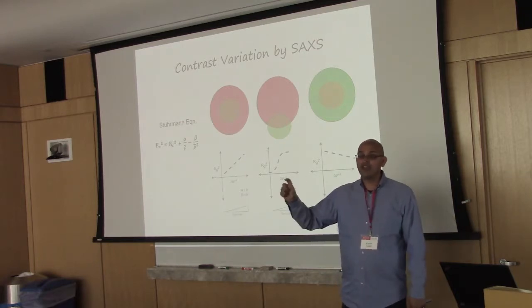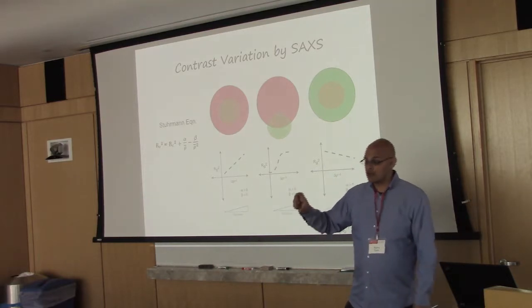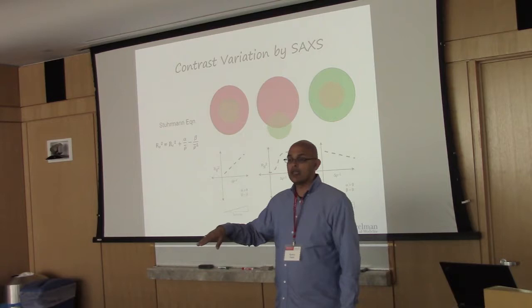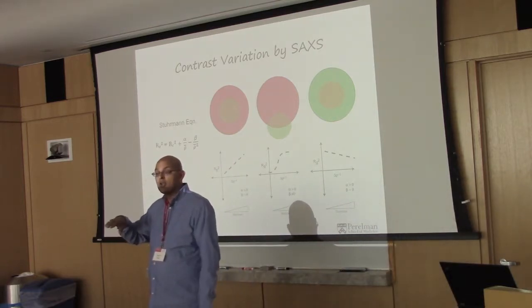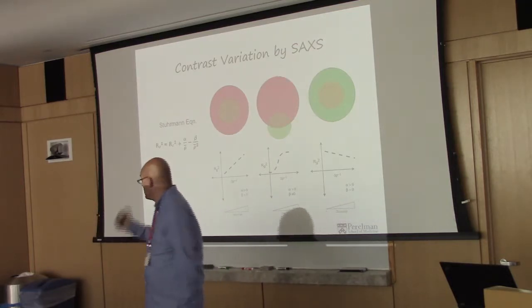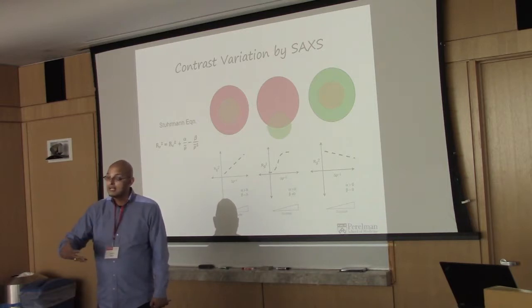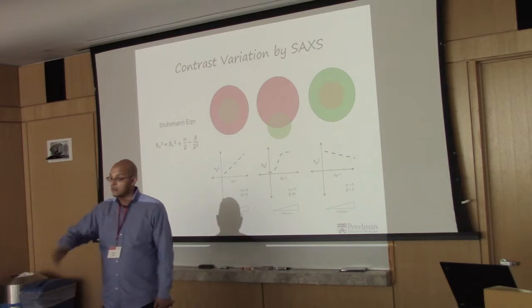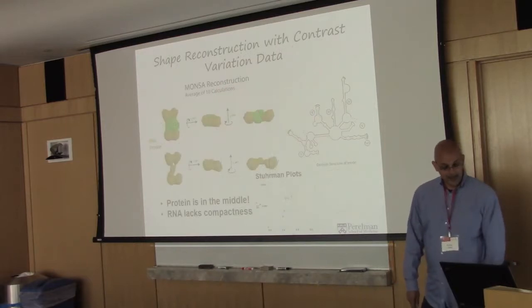I was leveraging the fact that big things scatter very strongly at small concentrations. If you're doing X-ray scattering on a ribosome, you can work at 0.2 mg per mL and get really strong scatter. With a mononucleosome, 200 kilodaltons and a lot of nucleic acid, you can work at 0.75 mg per mL and get very strong scattering. The group 2 intron, 70% RNA, 440 kilodaltons, lets you work in the low mg per mL regime and even lower and still get very strong scattering. That's not the case when working with, for example, an 8 kilodalton protein. Exact opposite.